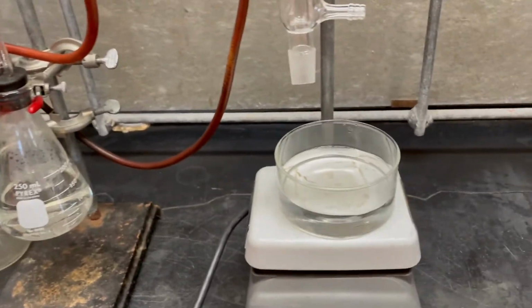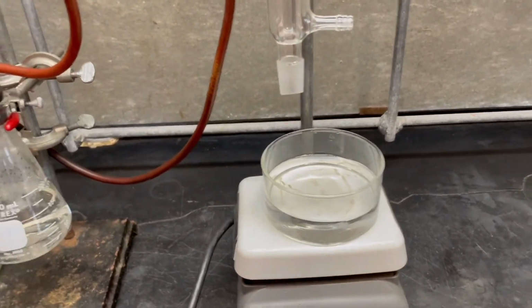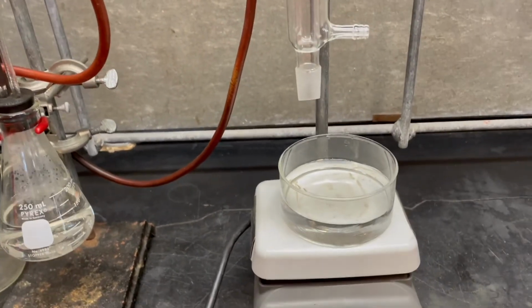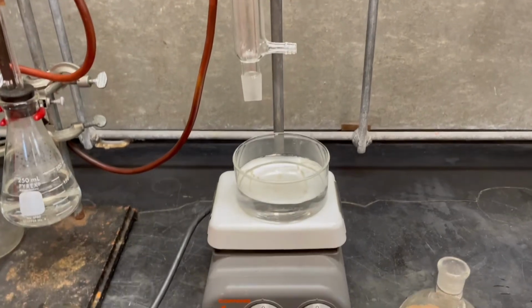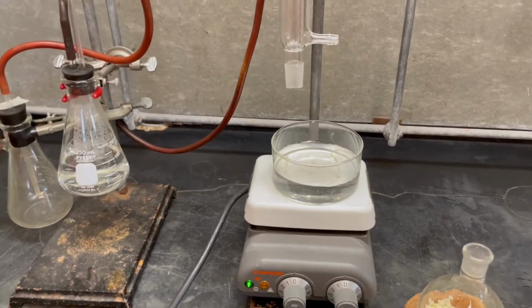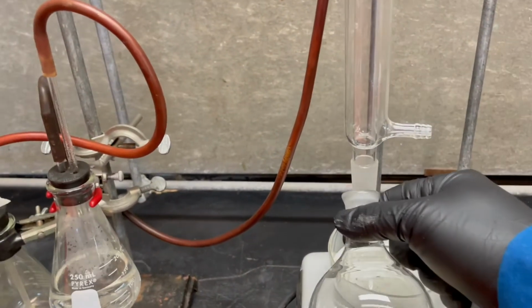Now I got to take out hot water from this thing. So it's a lot easier to either check using your actual reaction flask, see if the water level's good, or fill it partially, and then it's easier to put your reaction flask in there and then add water and allow that to heat than it is to take hot water out of a hot bath.